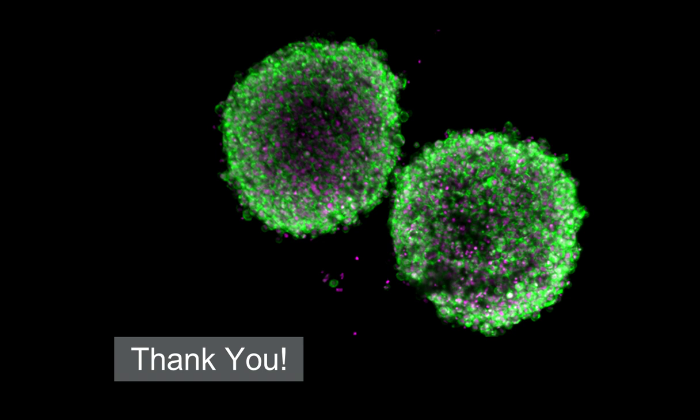Okay, so Chris, your first question is, how can I reduce photobleaching or phototoxicity when imaging thick samples?